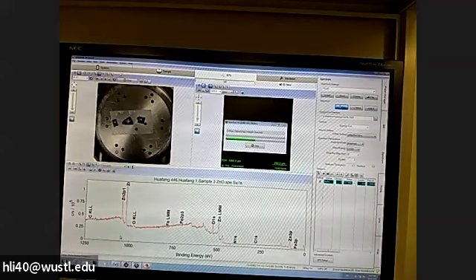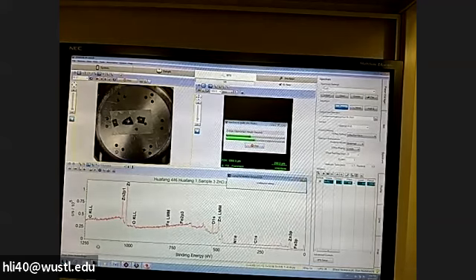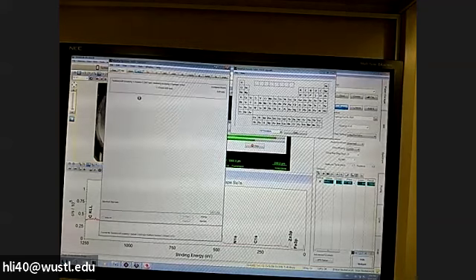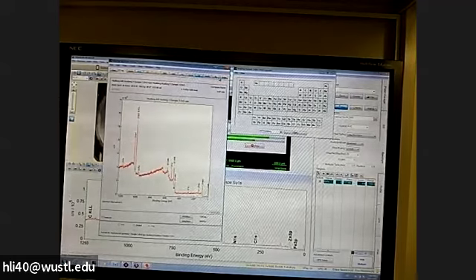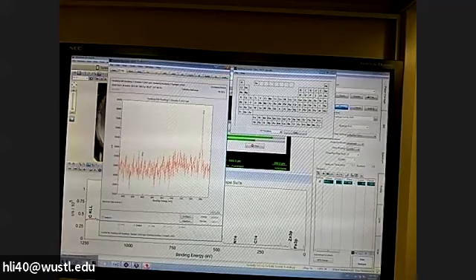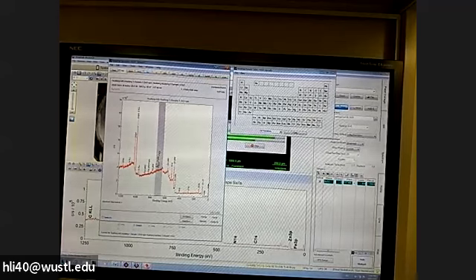When these spectra are collected, you can also have a better view in the analysis software called Multipack. Just click this Multipack software. Normally it's on. It's loading now. So we can take a look at the spectrum we just collected. Just click acquire. You can put ID there too. We would like to see whether we can see iron and nitrogen. If they're not there, you can put them there. It looks to me there's almost no nitrogen and almost no iron, but this is a very rough scale. It's hard to tell.